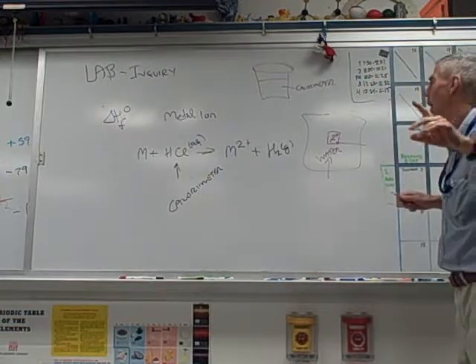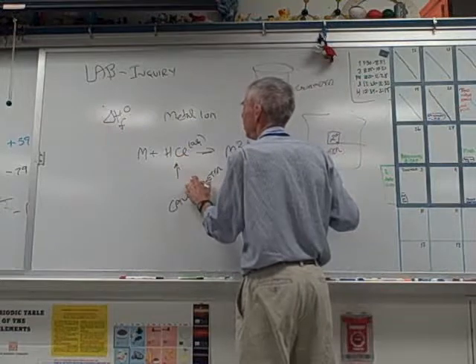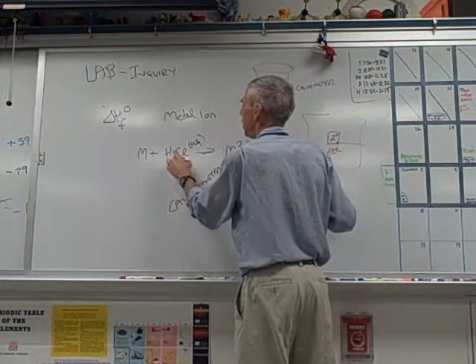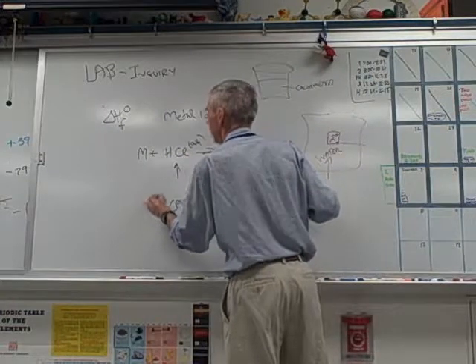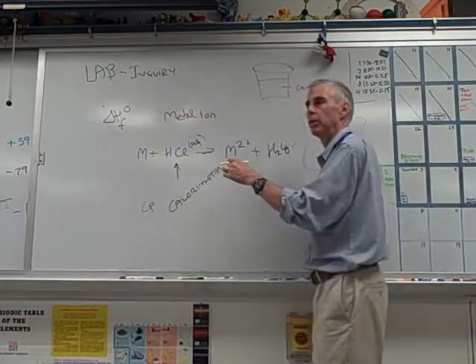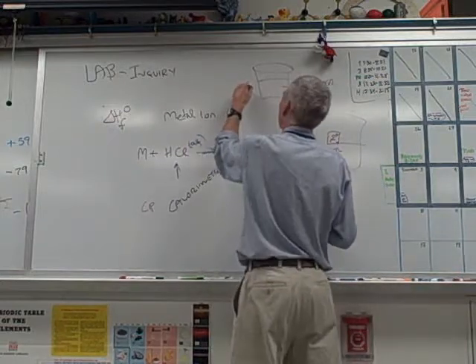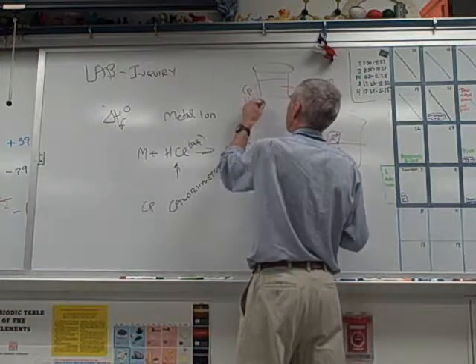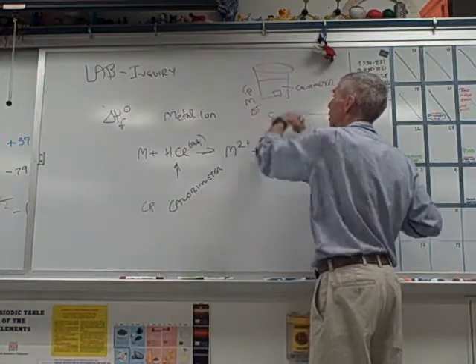All right, now, so here's the idea. One, we need to know the CP of this hydrochloric acid solution, okay? Because you've been using the CP of water and the mass of the water and the delta T of water to find the Q that was given off by, say, that piece of metal or given into the ice.